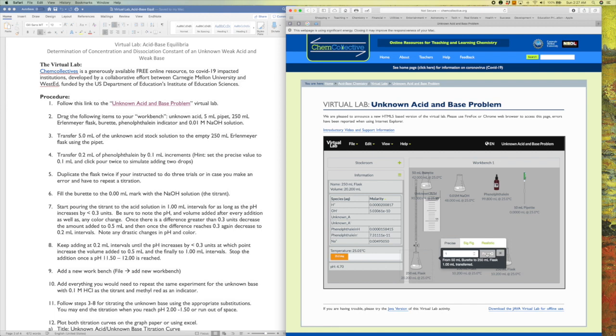Okay, I'm going to continue. And so that was an increase of 0.06. That was an increase of 0.05. And we are continuing with these 1 milliliter increments of addition. What you also want to remember is we have an indicator here, and that indicator should change pink when the solution has hit its endpoint, hopefully. So let's see.